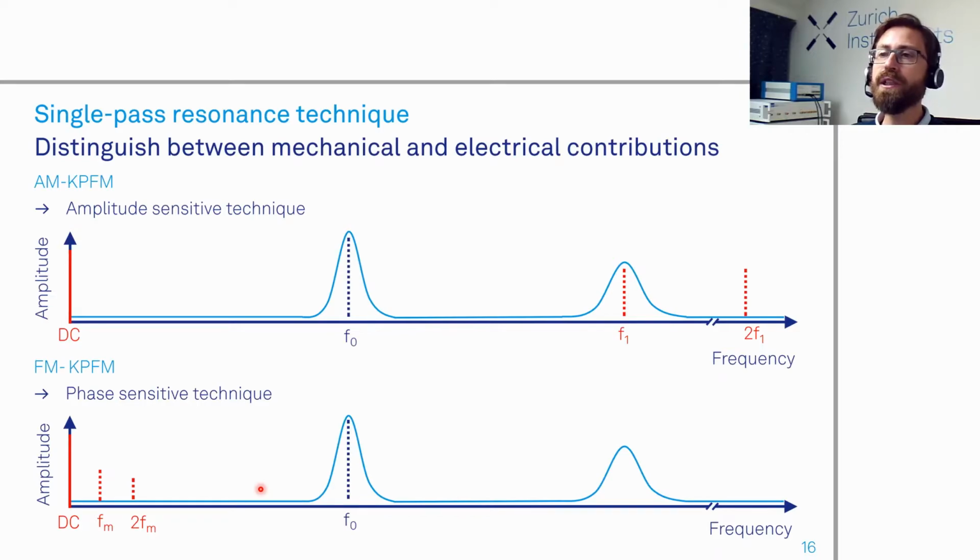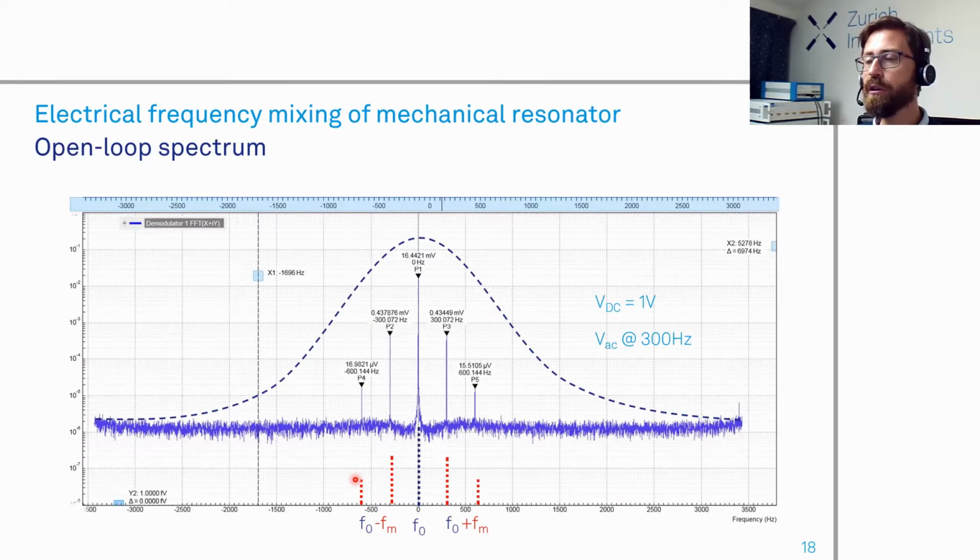It's going to create a detuning at this modulation frequency, and this gives rise to several sidebands within the bandwidth of this carrier. And now, very important between this FM and compared to the AM on top is that you have a phase relationship between the sidebands and the carrier. So it is a phase sensitive method.